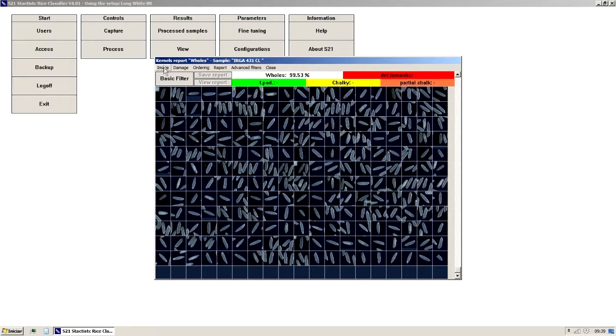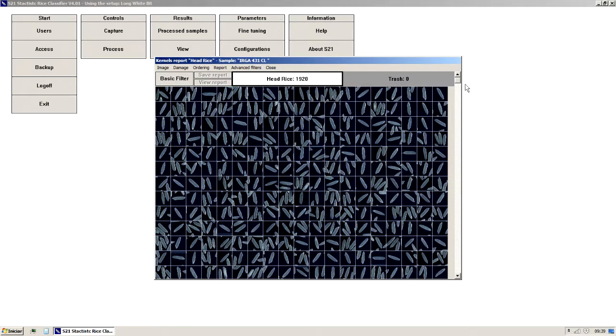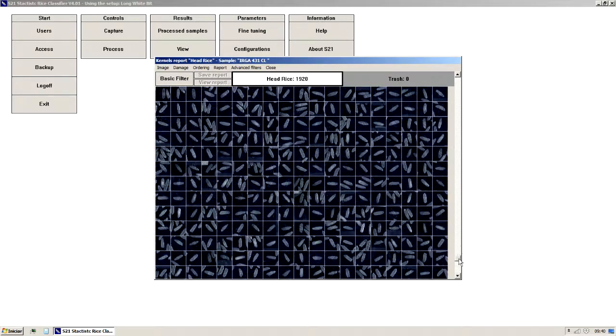In order to eliminate from the sample the tipless whole grains and leave just the perfect whole ones, we must access the S21 trash can resource. The system displays in this screen all the grains analyzed on this sample. Then, through length classification, we're going to group the smallest fragments at the end of this list. That's how the classification in descending order looks.